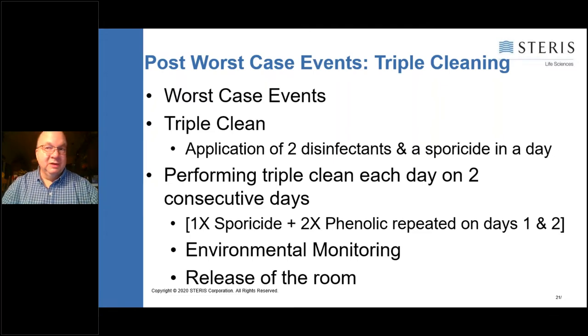And you can take environmental monitoring data after each phase of that, and you can have that as your in situ field trial validation data. Regulators love to see that.